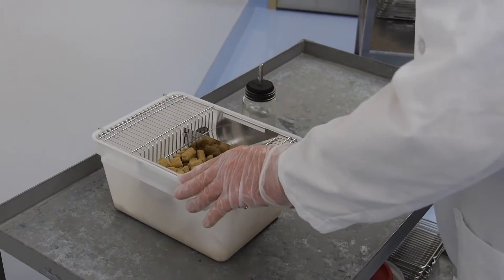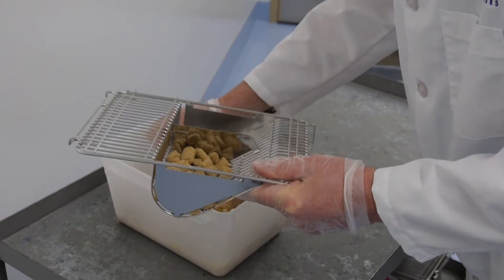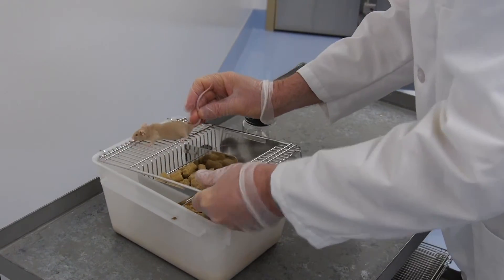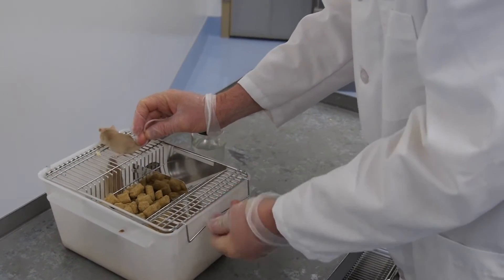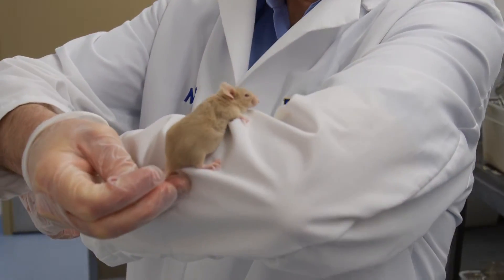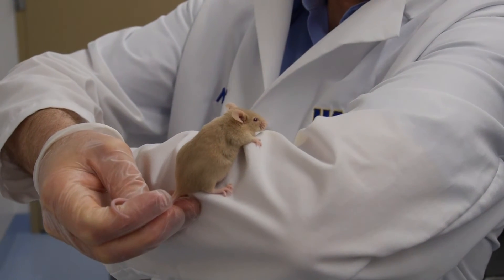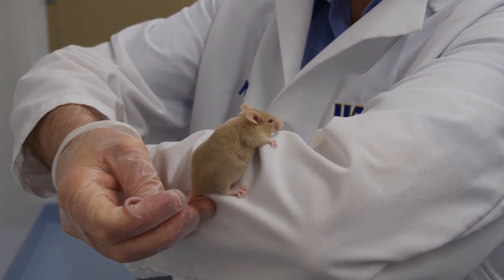The final technique is to use my arm as support for the animal. I lift the animal up by the base of the tail, put it on the cage top, and then lift it towards my arm. As such, I can have a close look at it to see if it's healthy or if there's any issues that I need to be aware of.